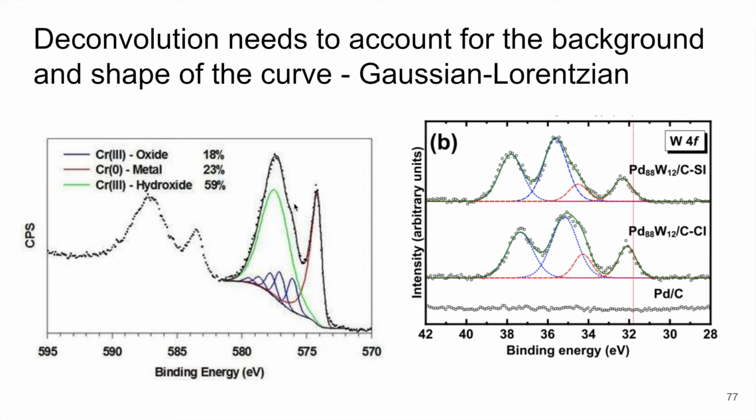And so you can imagine that there's probably multiple peaks convoluted together, just overlapped. And so the process of deconvolution is fitting such that we can figure out what is going on in the one large, not symmetric peak here.